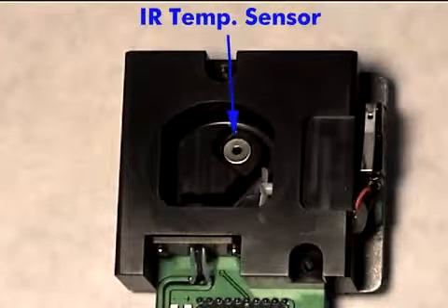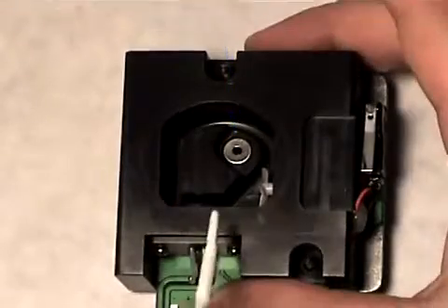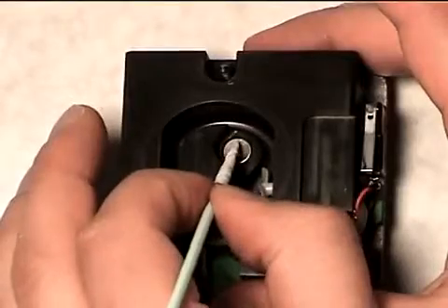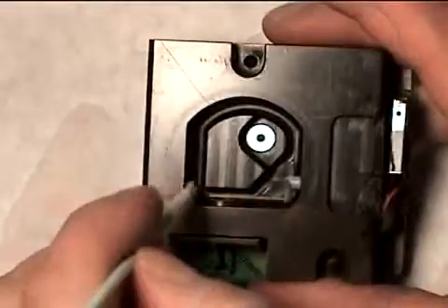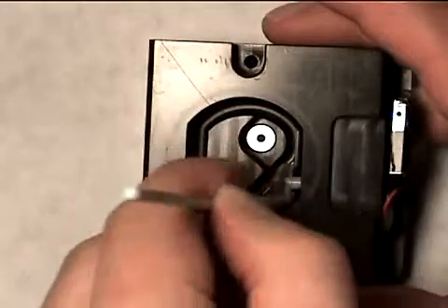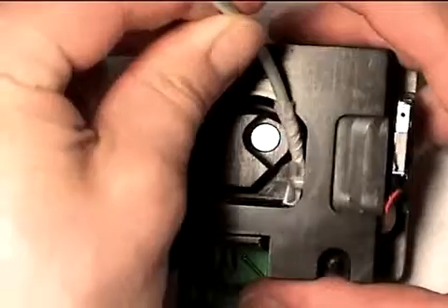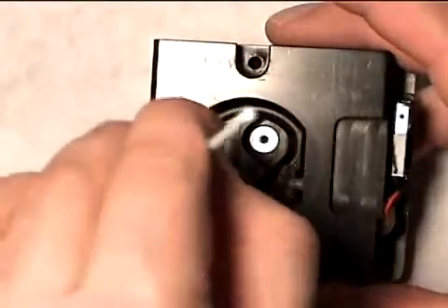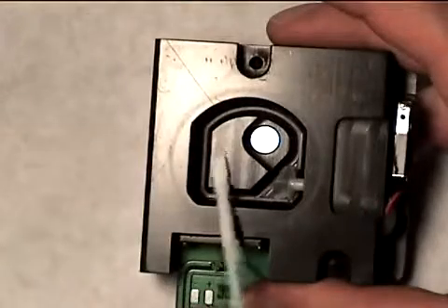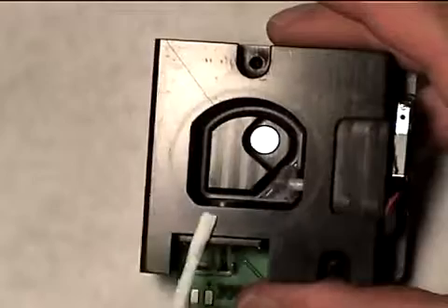Start by cleaning the mirror and optical sensor using gentle pressure. Next, clean the infrared temperature sensor using a circular motion. Finally, clean the surfaces of the block, including the recessed areas, under the fan blades, the center area around the sensor, and where the cup makes contact with the block.